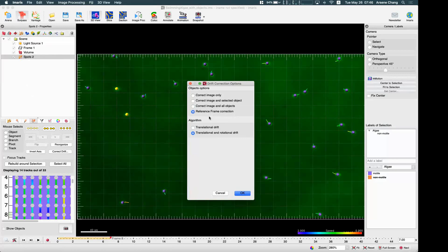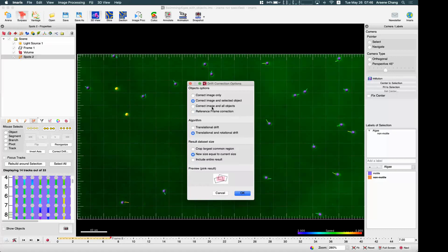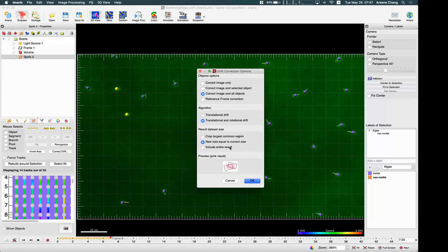If I choose 'Correct Image Only,' then based on the spot I selected, Imaris will run the drift correction on the image only without touching or changing the previous track result. We can also correct the translational and rotational drift. For 2D datasets, if you want to correct rotational drift as well, you will need at least two spots. For 3D, you need at least three spots to correct the rotational drift.